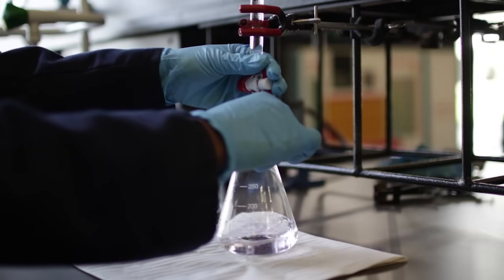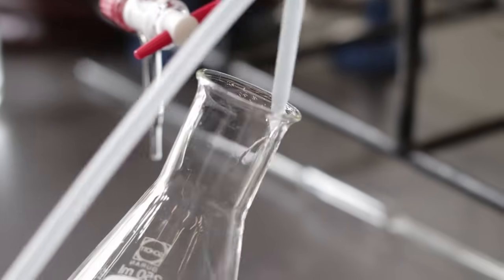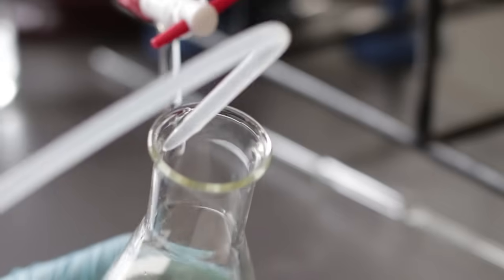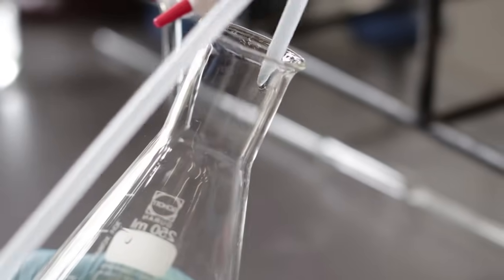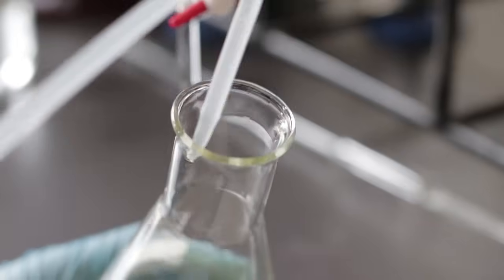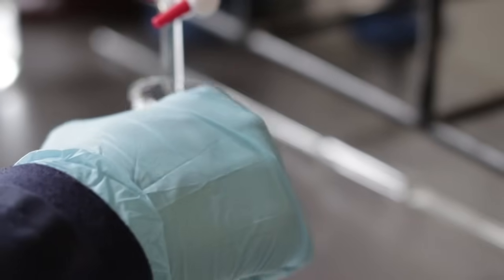When approaching the endpoint volume, a good habit is to wash the sides of the conical flask with distilled water from a wash bottle. As when swirling, the side of the conical flask will touch the tip and some of the titrant will stick to the walls of the flask.